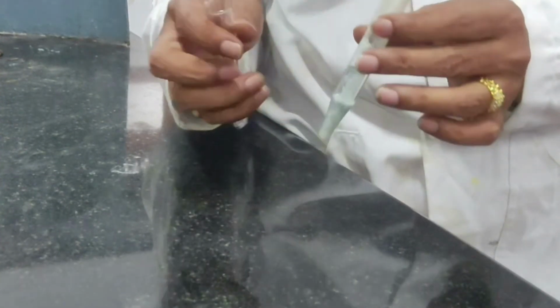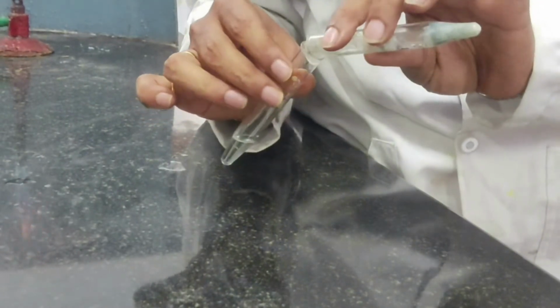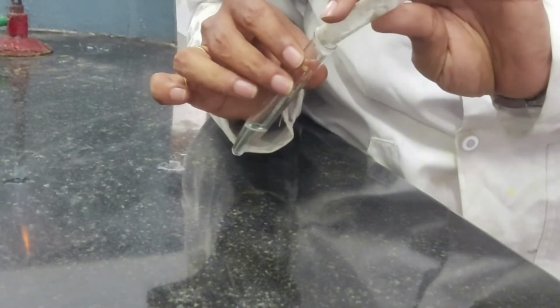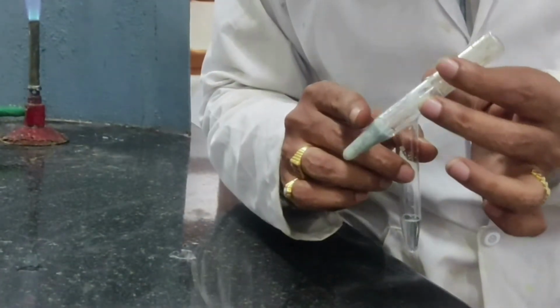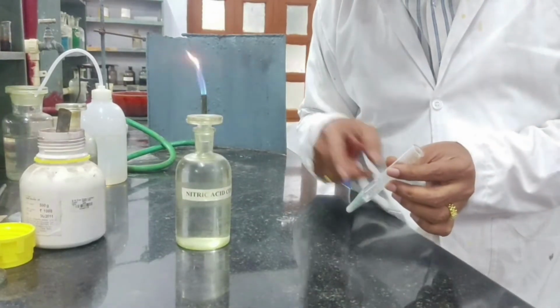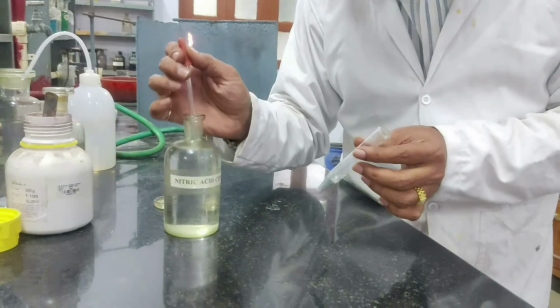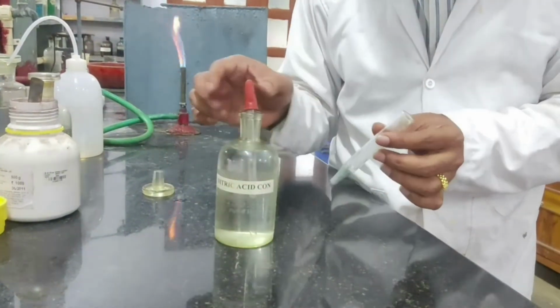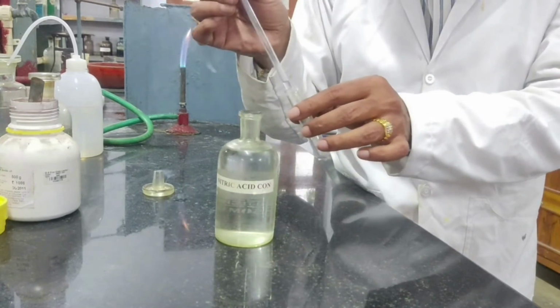So I am separating the centrifugate from the residue. Okay, fine. I have separated. This is to be tested for Zn plus 2. This is to be tested for Mn plus 2. Okay, let us see how we are going to test. To the residue, I am adding few drops of concentrated nitric acid. You see, I am taking concentrated nitric acid. I am adding few drops of concentrated nitric acid to the residue.